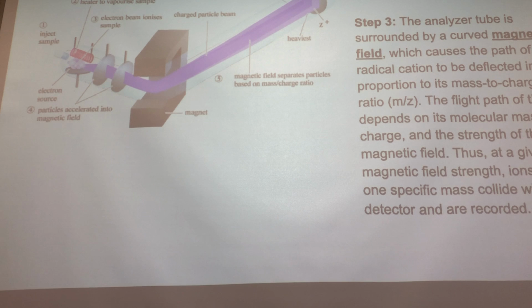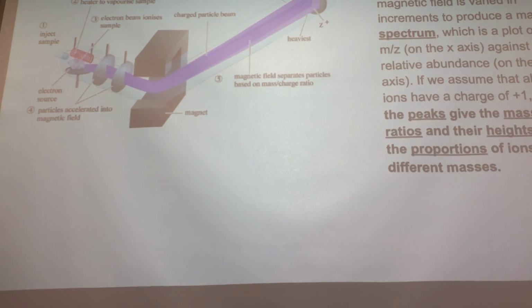The magnet, right? So that's like our blow dryer, sends it through, pushes it to a side, and then finally the part that we're going to focus on is the spectrum. Okay, what we get in the end from the data. A spectrum is created which tells us how often something hit in a certain spot, and it can then be used to calculate its atomic mass as well. The nice thing is we don't have to do the equipment itself, the mass spec gets all that for us. We just get the graph, and now we're going to learn how to interpret these graphs.